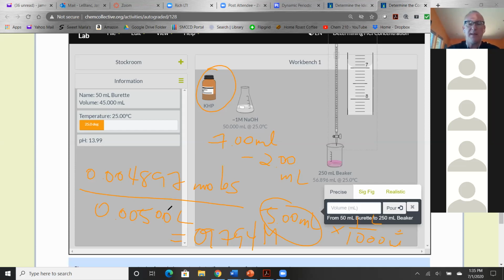add. I mean, you may be able to get a result more precise than this, because I was adding 0.05 mL at a time. You might want to do it more slowly than that. You might want to go 0.025 mL at a time. You'll get a more precise answer. But what's my answer? What's the answer we came up with together? What's my final answer for the concentration?